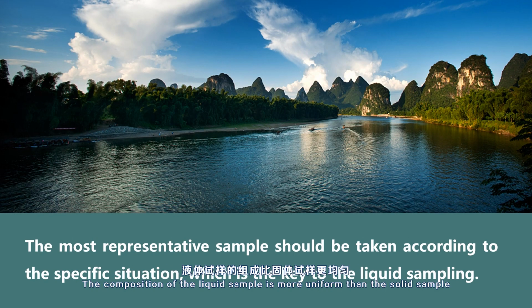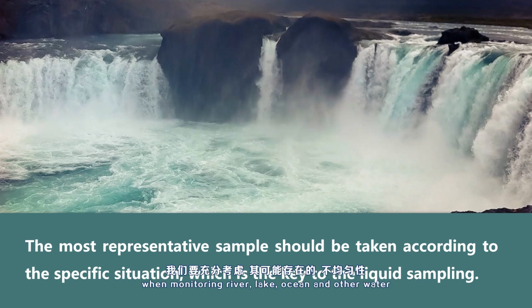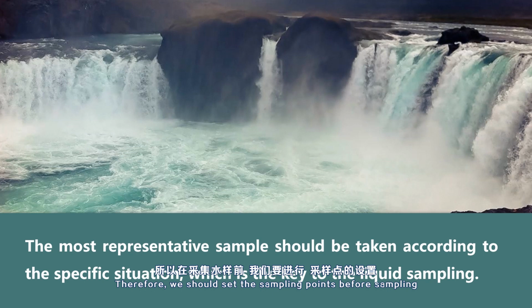The composition of the liquid sample is more uniform than the solid sample, but we still need to fully consider the possible inhomogeneity when monitoring river, lake, ocean, and other water. The most representative sample should be collected according to the specific situation, which is the key to the liquid sampling. Therefore, we should set the sampling points before sampling.